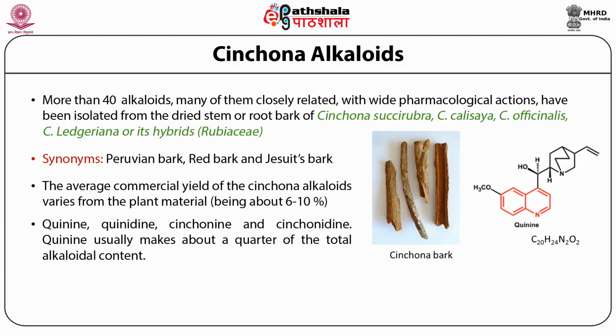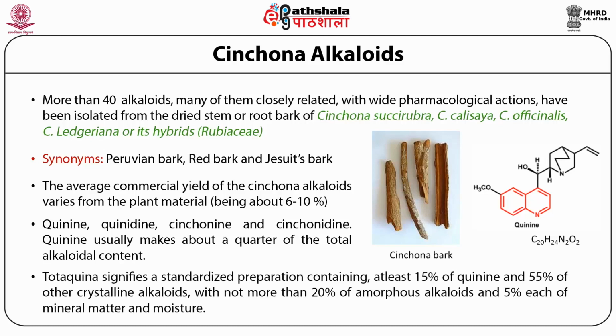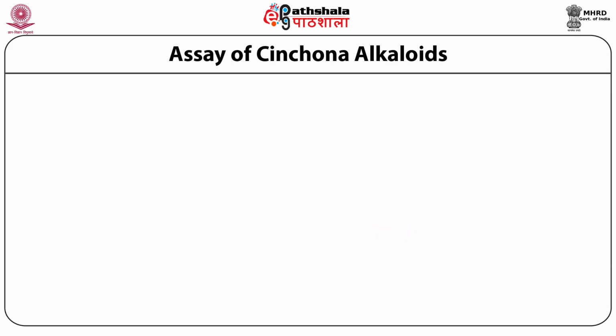Just to mention that totaquine was a standardized preparation containing at least 15% of quinine and 55% of other crystalline alkaloids. Earlier it was used extensively before the isolation of these quinine alkaloids in pure form. Now let us discuss the assay of cinchona alkaloids. The total alkaloids in cinchona can be estimated by the following method.